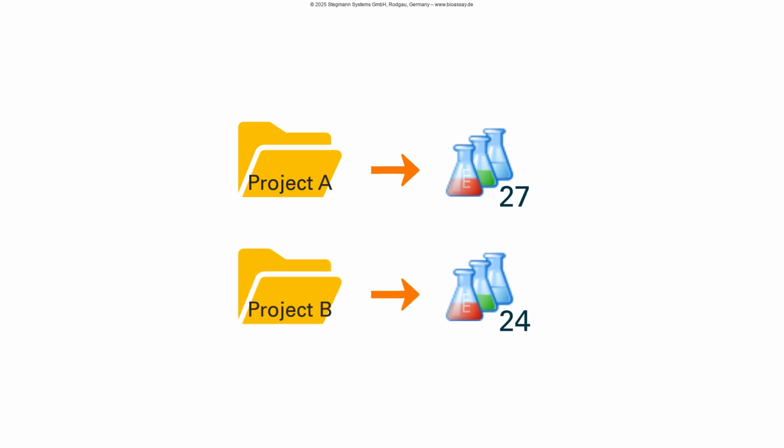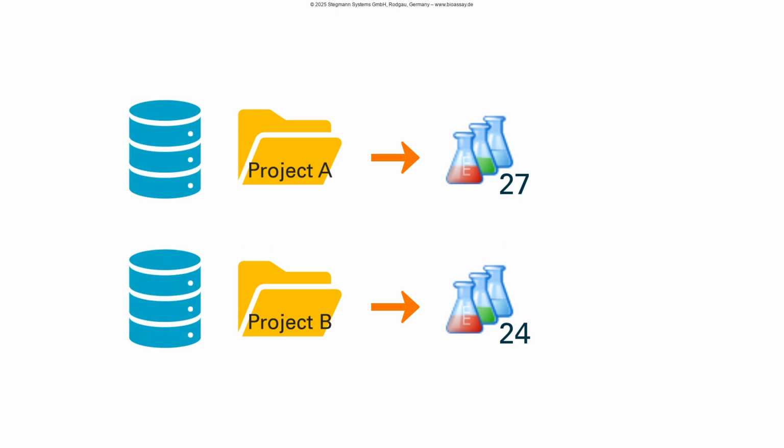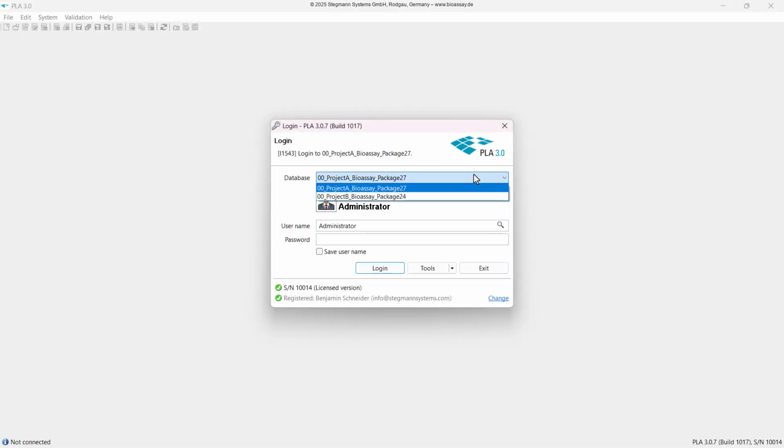for compatibility reasons. For strictly regulated environments, I recommend having separate databases for each add-on version at hand. This allows me to simply log into the database I want to work with.